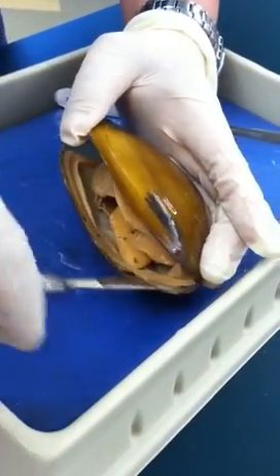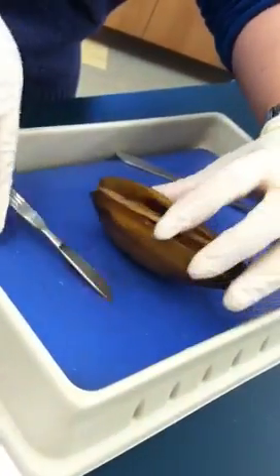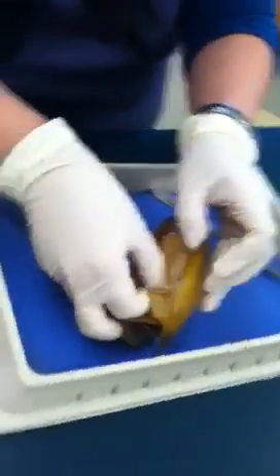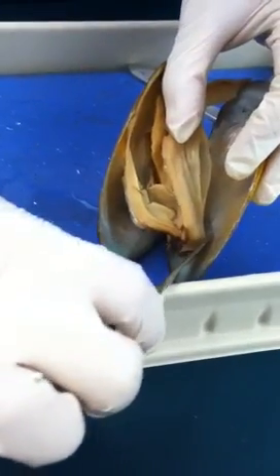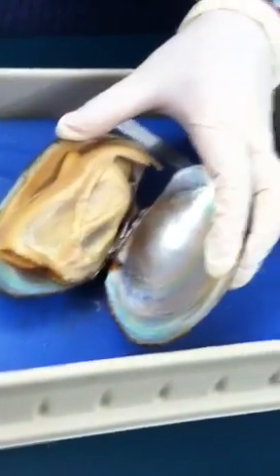Cut along it and then gently scratch it off, and open it up slowly to make sure everything is detached. Sometimes the muscle is attached to the shell, so what you need to do is gently cut through the muscle, and then you can see the internal structure.